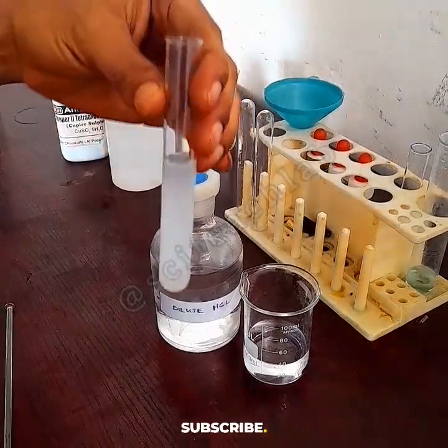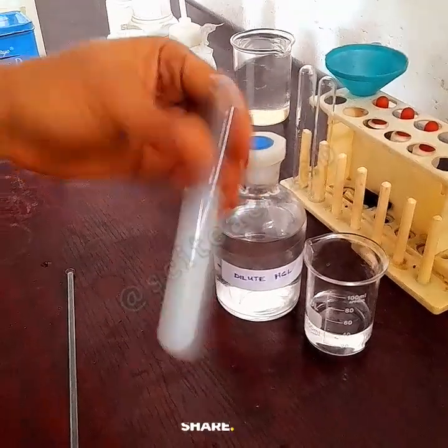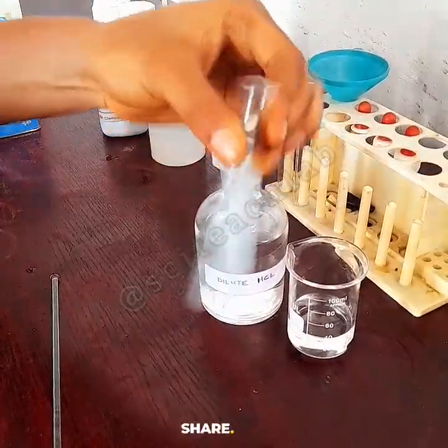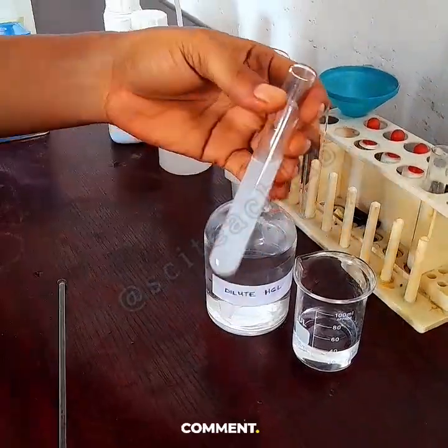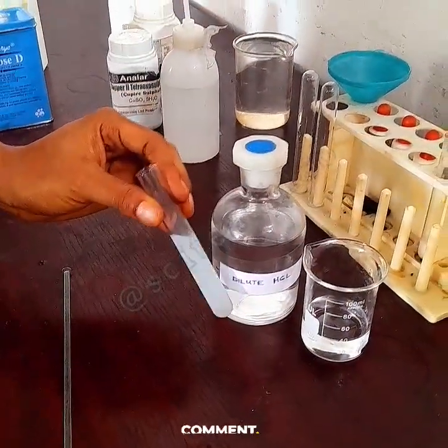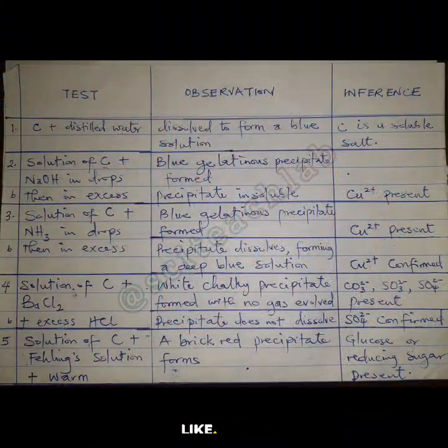The chalky precipitate comes in and stays persistent, it doesn't dissolve. So we have the same result as if we added barium chloride first. That means the ion present here is actually sulfate ion, because sulfate ion won't dissolve in excess hydrochloric acid and barium chloride.